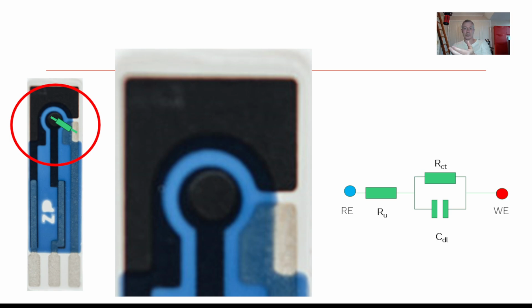every time I change a voltage, when I'm doing cyclic voltammetry, I keep changing the voltage, and the ions rearrange, and the ease with which that rearrangement takes place dictates my double layer capacitance. Then I have my solution resistance. I call it RU here, and I realize RU means uncompensated. Most of the time, in most electroanalytical work done on screen printed electrodes, that solution resistance is quite low. But I will do some calculations to see what the significance of solution resistance can be. But let's say that resistance was quite high.